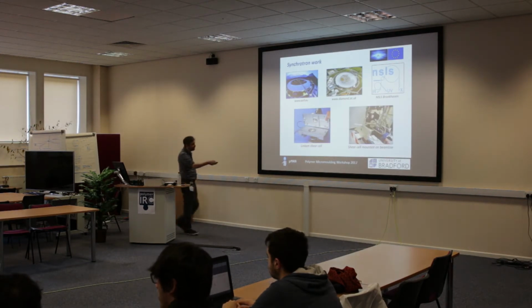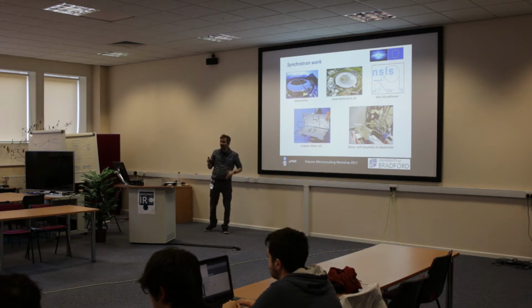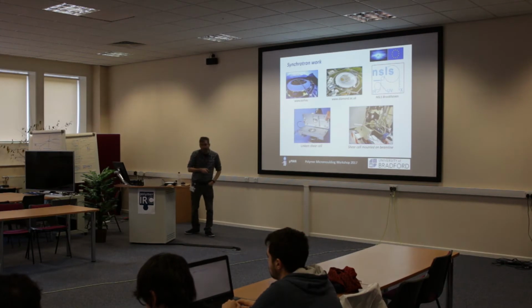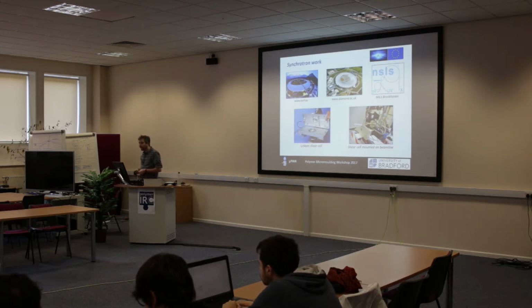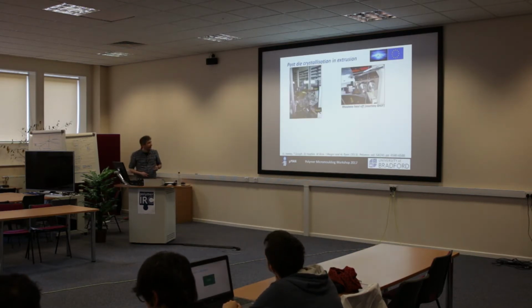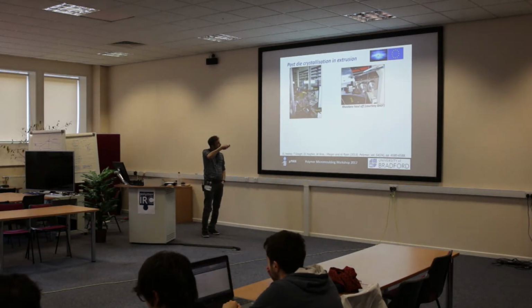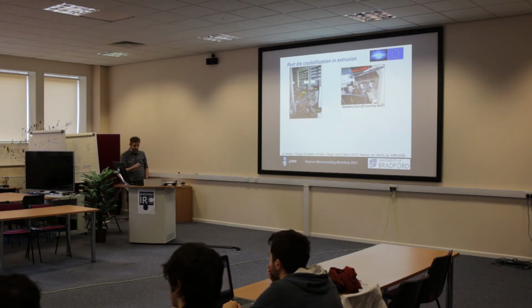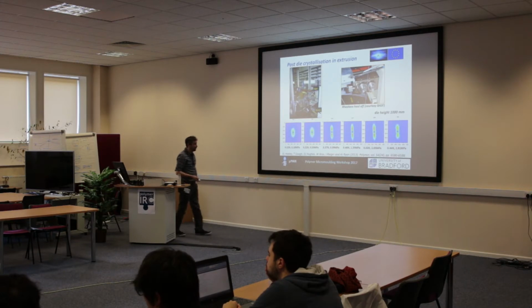So we use special tools. This is a shear cell. It's basically a mini rheometer that we mount into our beamline, where the X-rays are going through. The cameras here are 8 meters in length, fully evacuated tubes, and massive, so we can get everything out that we need. An example here is we actually took an extruder and mounted it in the beamline, so the X-rays are going through there. We hauled off the material at a very gradual but controlled rate, so we knew exactly what the force was. And this is the type of thing we saw.